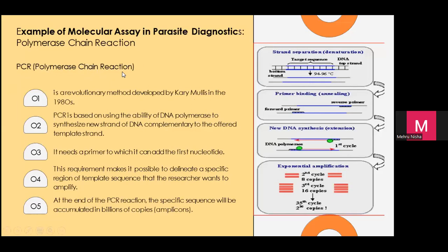Jadi kita just ambil dia punya rambut, bendalir, and we do a PCR. Aside from that, dalam bidang pertanian, banyak PCR digunakan untuk GMO, nak tengok, okay, ini adakah baka yang baik untuk padi and so on. Okay, so that is importance of PCR. So everyone actually, if you're coming from the lab base, you must have the idea of PCR. Kalau tak dapat hands-on pun, you must ada a bit of idea lah.